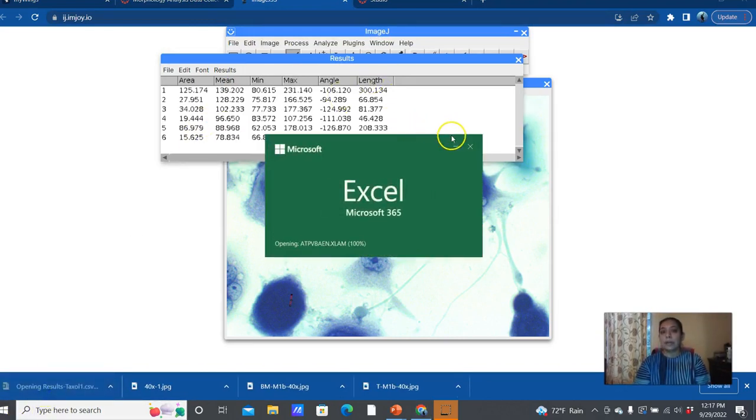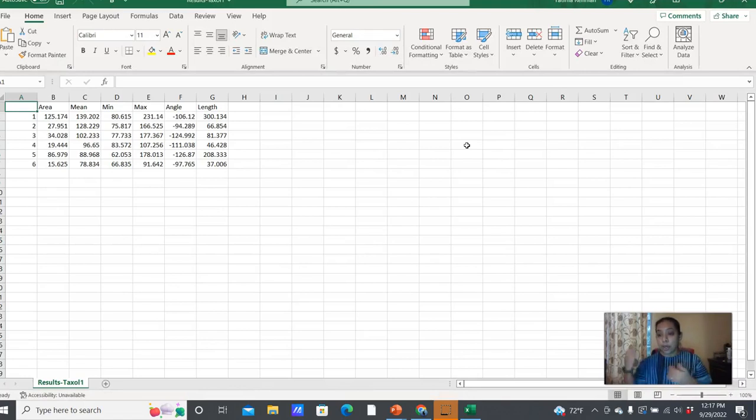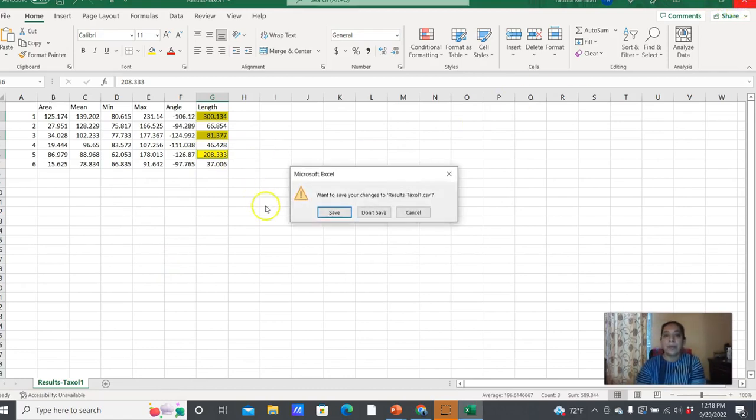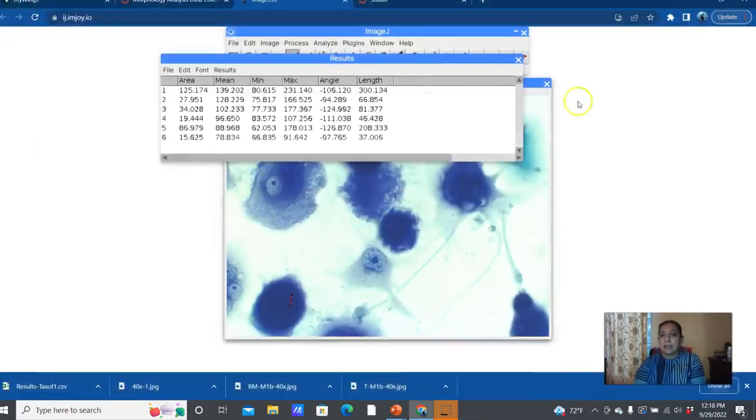You can also write these numbers down in the sheet that is provided to you for the three, in that chart with the cell measurements. You're going to write this one, in my case, right? Every other one is a cell measurement. So I'm going to go ahead and select my 3 cell measurements and color them so I know these are my cell measurements, and then I'll have my other 3 measurements. Those are my nuclear measurements. Now here is an interesting thing. I can actually have other measurements as well that I can make with Excel, okay?